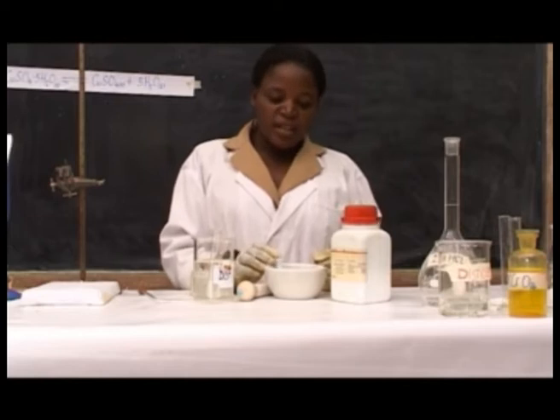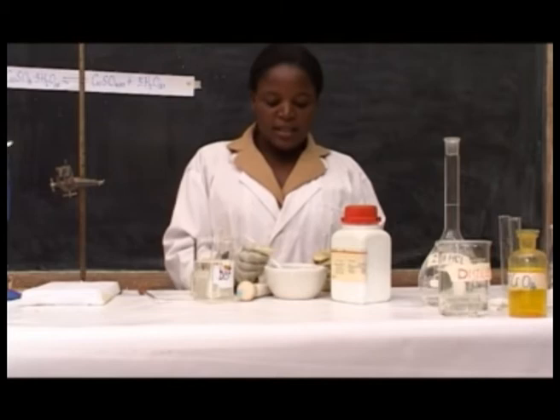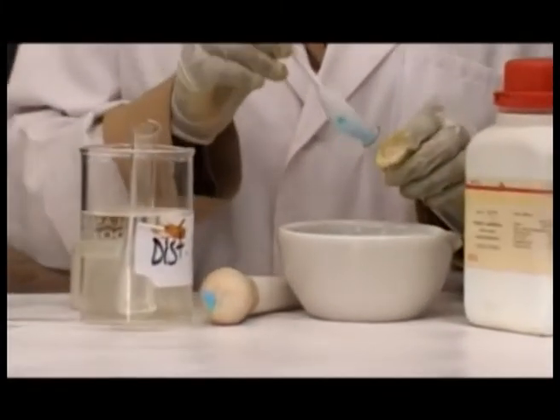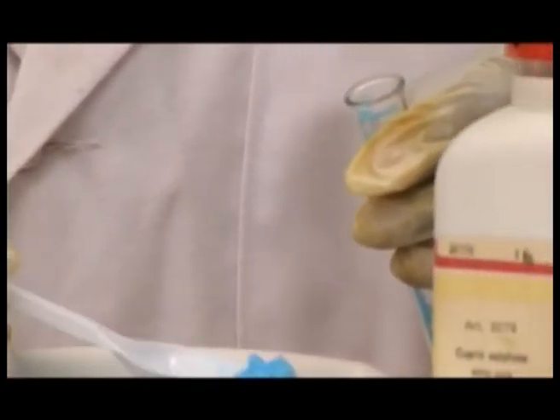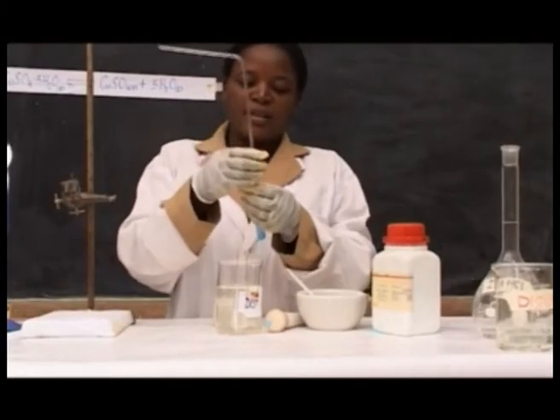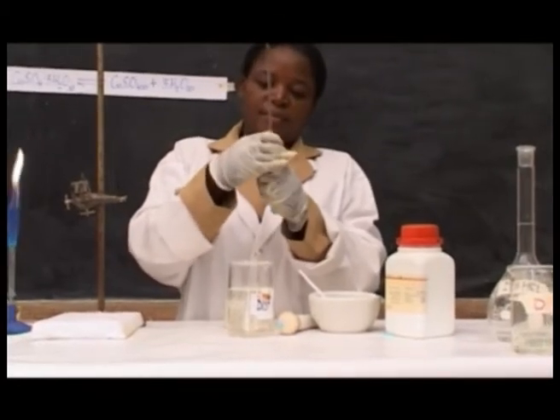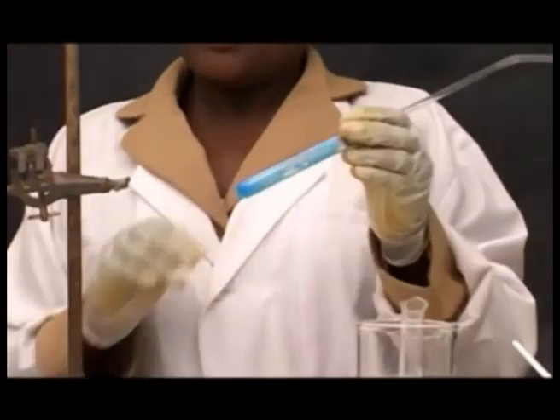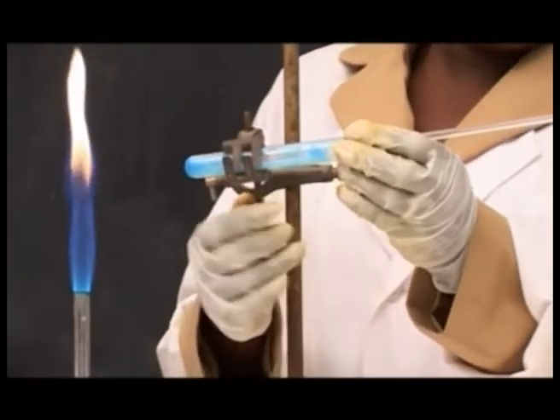Take a little amount of copper sulfate and place it in a hard glass test tube. Then stopper the test tube and tie it to the retort stand.